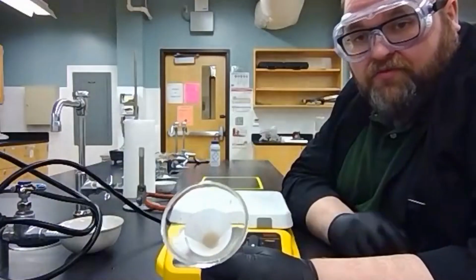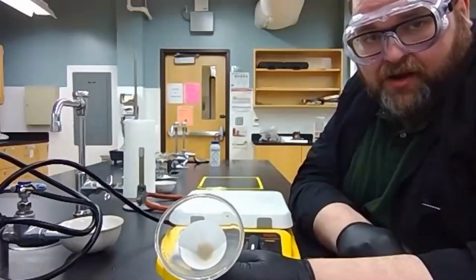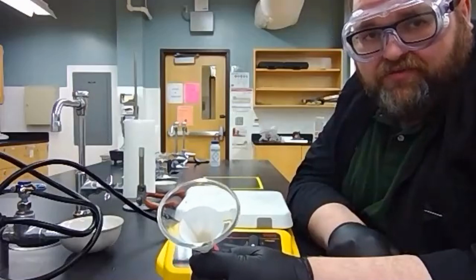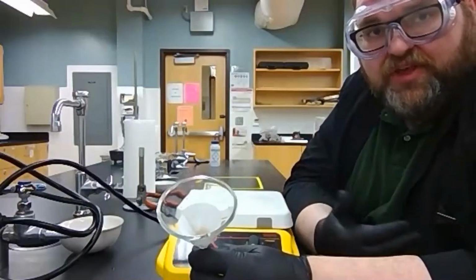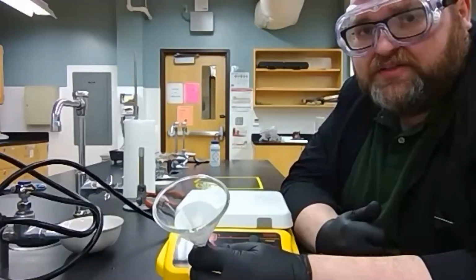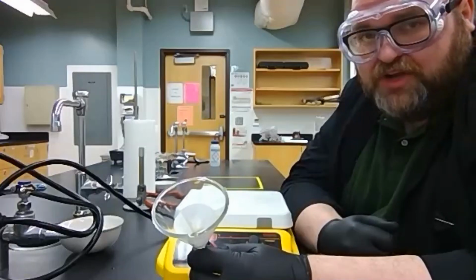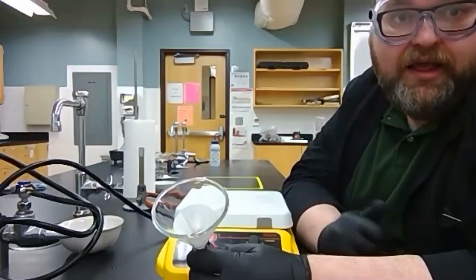So we now have a wet sand thing going on in here. And if I want to know how much sand there is, I have got to get rid of that water. So the way I'm going to do that is I need to gently heat this, but I still need to get it very, very hot. You could put this in a fire, but I don't think that's going to end well for you. You'll catch your paper on fire, and you might not be able to collect your sand at the end.